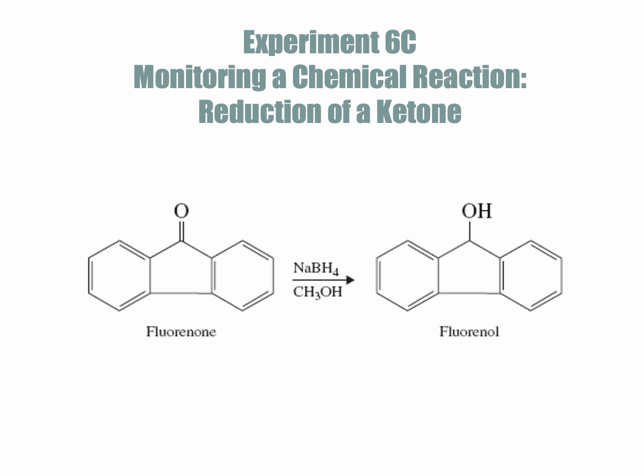But we can use TLC to help us monitor how a reaction is moving by counting how many compounds there are. If we start with A and B, at the beginning of the reaction, we're only going to have A and B. But then if we create C, at some time as the reaction progresses and we spot that mixture, it will have another spot that we didn't see before because we just created a new compound. So we can track the progress of a reaction by using TLC and count the number of compounds.